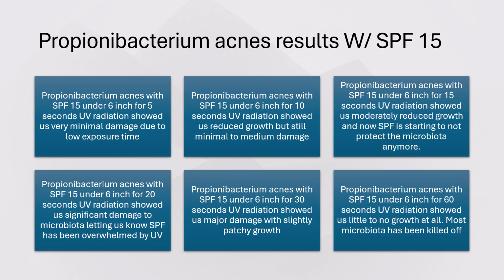So we saw very patchy growth and very minimal colonies. And then once you get up to 60 seconds of UV exposure, this showed little to no growth at all. You have to remember, the reason that Bacillus lasted so well was because it has these endospores, and these endospores are so tough. But P. acne does not have these endospores, so almost all microbiota have been killed off at this point.